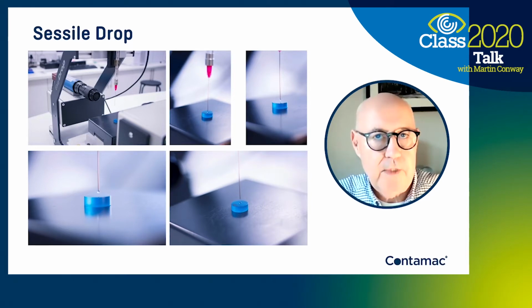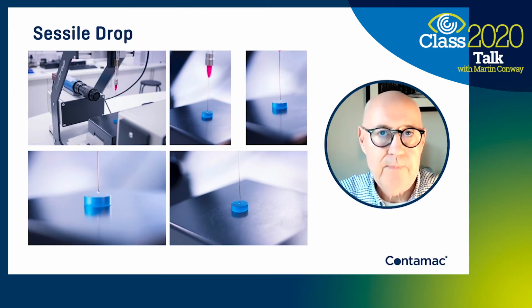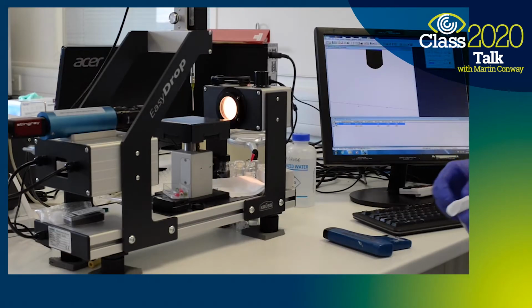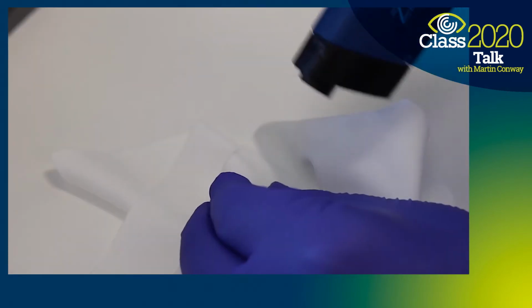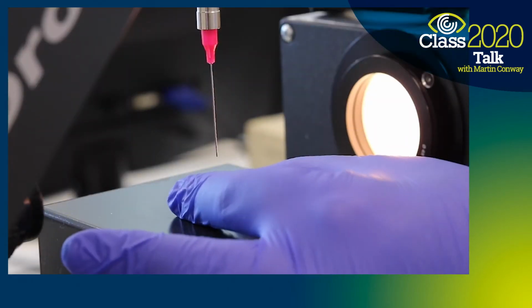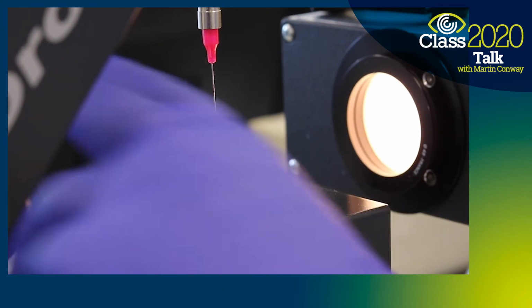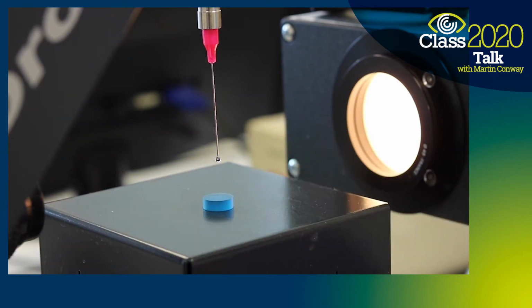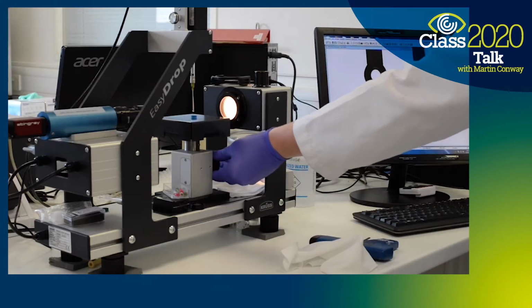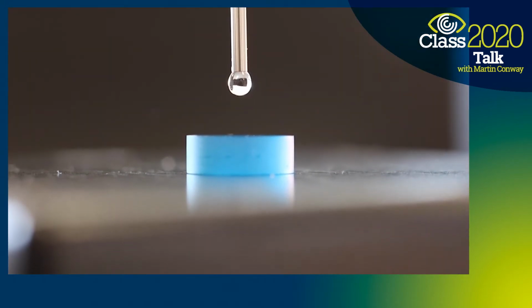We'll now look at a short video clip showing one of our scientists conducting the sessile drop measurements in the laboratory, and I'll talk you through the various stages of the procedure. That gun you see there is an anti-static device that removes any static electricity from the surface after the lens has been blotted. Obviously, the rubbing can actually generate static on the surface of the lens. The surface of this button has been polished to match that of a finished lens, and then a carefully metered dose of 10 microliters of water is gently introduced to the surface of the material from the syringe.